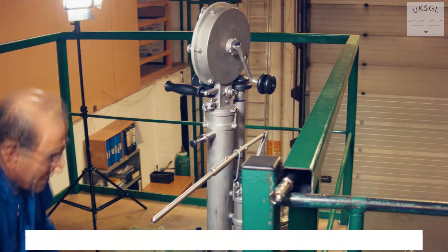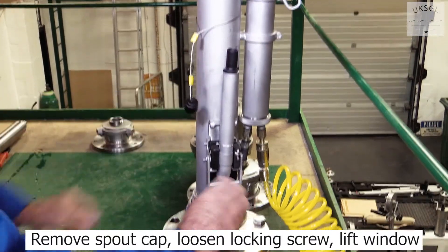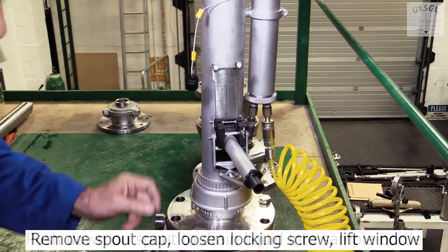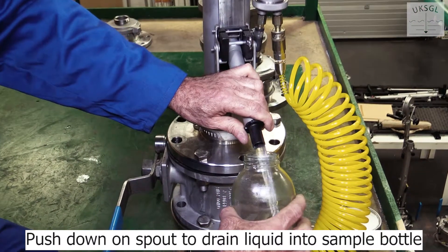Then press the plunger to prevent the sampler closing. Remove the spout cap, loosen the locking screw and lift the window. Push down on the spout to drain the liquid into the sample bottle.